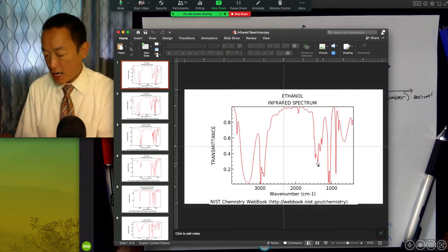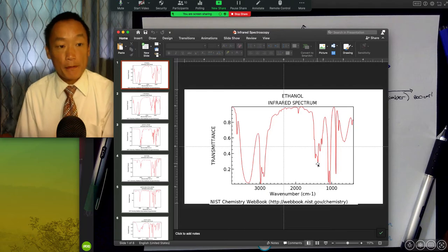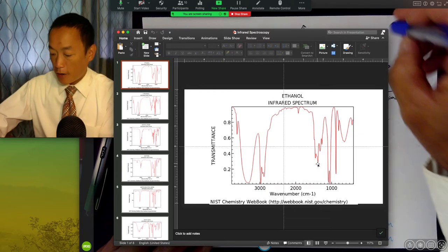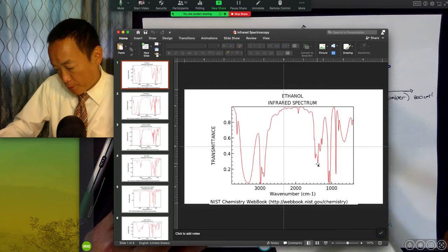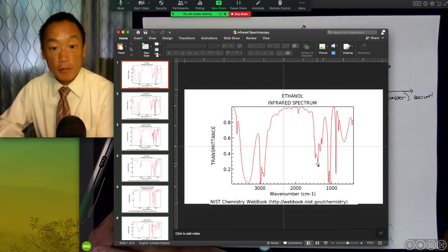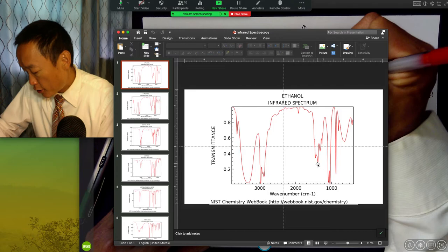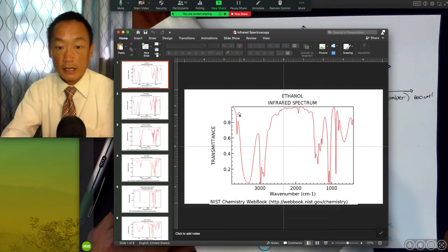At that point in time, every single type of bond, that should be the take-home message, every single type of bond in our sample has its own energy, and when it comes in contact with that energy, it starts to become excited. And so perhaps, and I'm not necessarily saying that this is true, but when we look at the sample of ethanol, this red, it passed through the sample and there was nothing that got excited at all. And so maybe we're looking at the 3,900 inverse centimeters in this spectrum of ethanol. So we'd be looking at this right here.